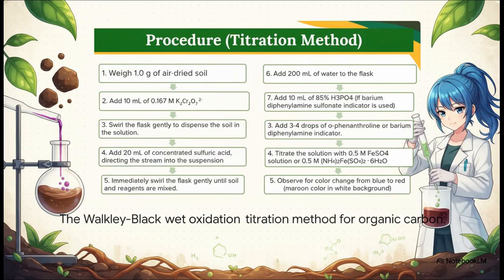Then comes the fun part. We titrate the solution with ferrous sulfate. We're watching for a highly distinct color shift going from blue to a deep maroon or red against a white background. When it shifts, boom, that's our chemical endpoint.